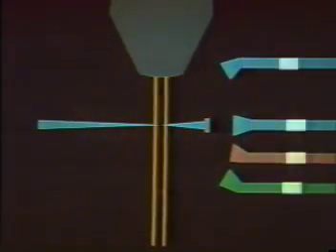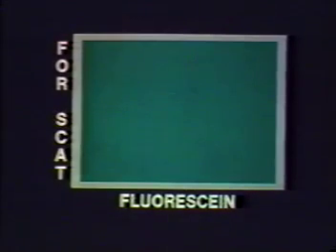While FACS Desk is collecting this permanent list of data points, Keith can watch a transient 2-parameter display of the data on the FACS console oscilloscope. Keith's oscilloscope is currently set to monitor the fluorescein and forward scatter channels. This means that every time the FACS console receives a set of signals for a cell, it plots a point on the oscilloscope reflecting the relative amounts of green fluorescence and forward scatter detected for that cell. Taken together, these dots create a pattern often called a dot plot. This plot shows that most of the cells in this sample scatter relatively little laser light.